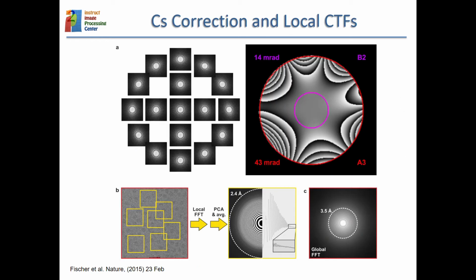And for these CS corrected microscopes, there are some ways of estimating the effect of the CS in different regions of the micrograph, and correcting for those. And all this goes in the direction that very accurate CTF correction is certainly the way to go to achieve extremely high resolution.